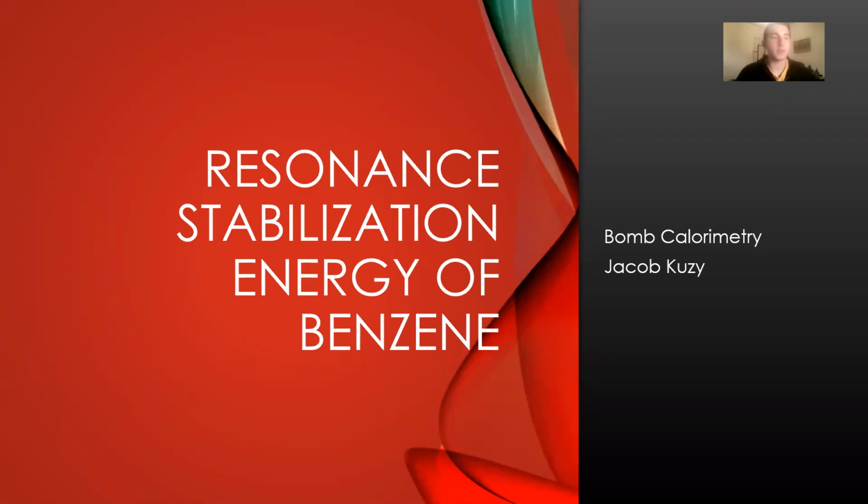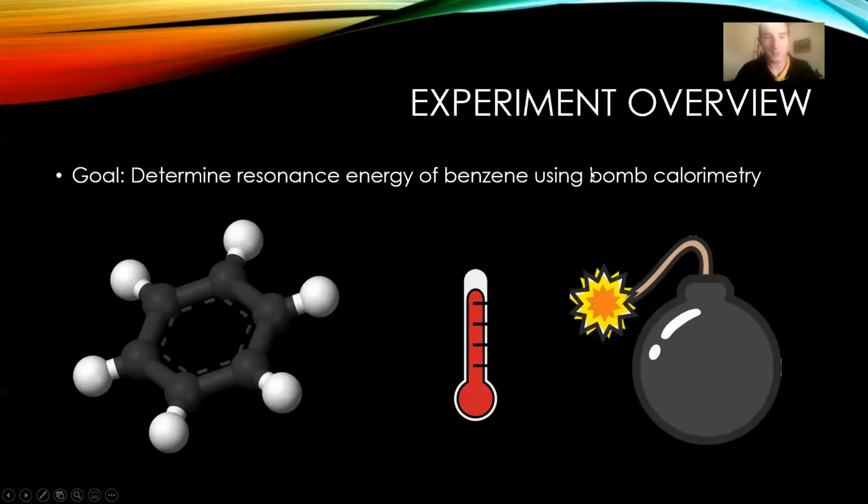All right, hi. I'm going to be discussing this experiment called the resonance stabilization energy of benzene, and we've accomplished this using bomb calorimetry. I'll be going over what bomb calorimetry is and how it is used to calculate the resonance energy, and then all the results from the experiment. So let's dive right in.